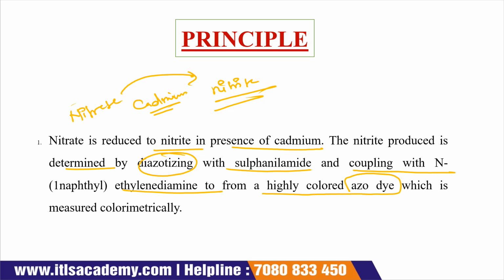This dye can be measured with the help of an instrument called a colorimeter, or it can be measured colorimetrically.